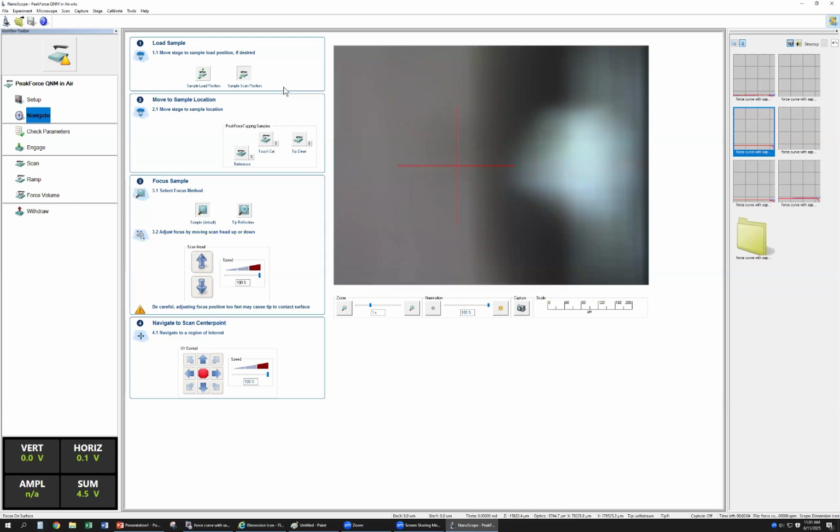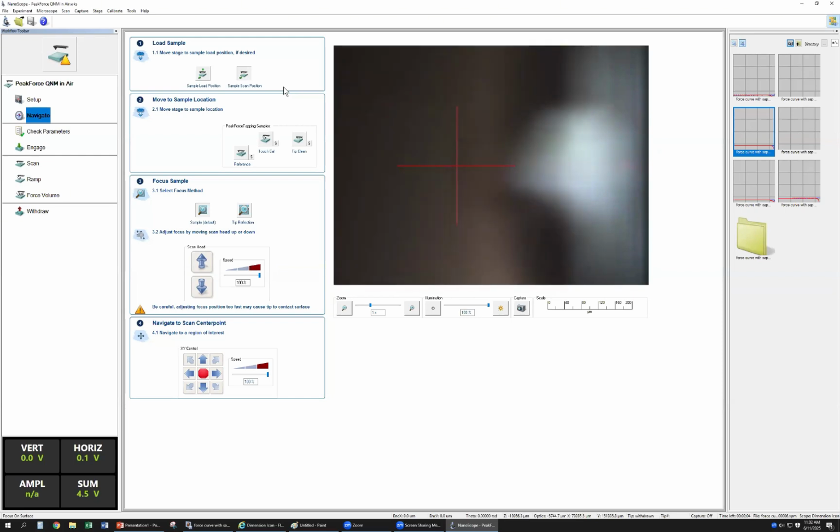Okay, we use number 3, sample number 3. Yesterday you pushed it, number 3. And we can take out this one.